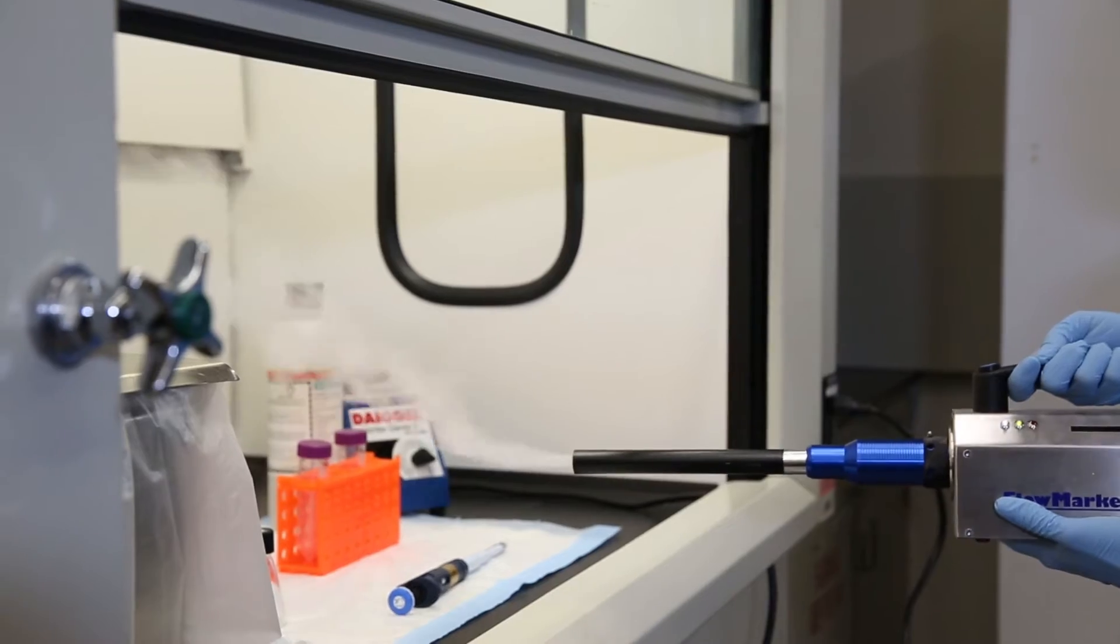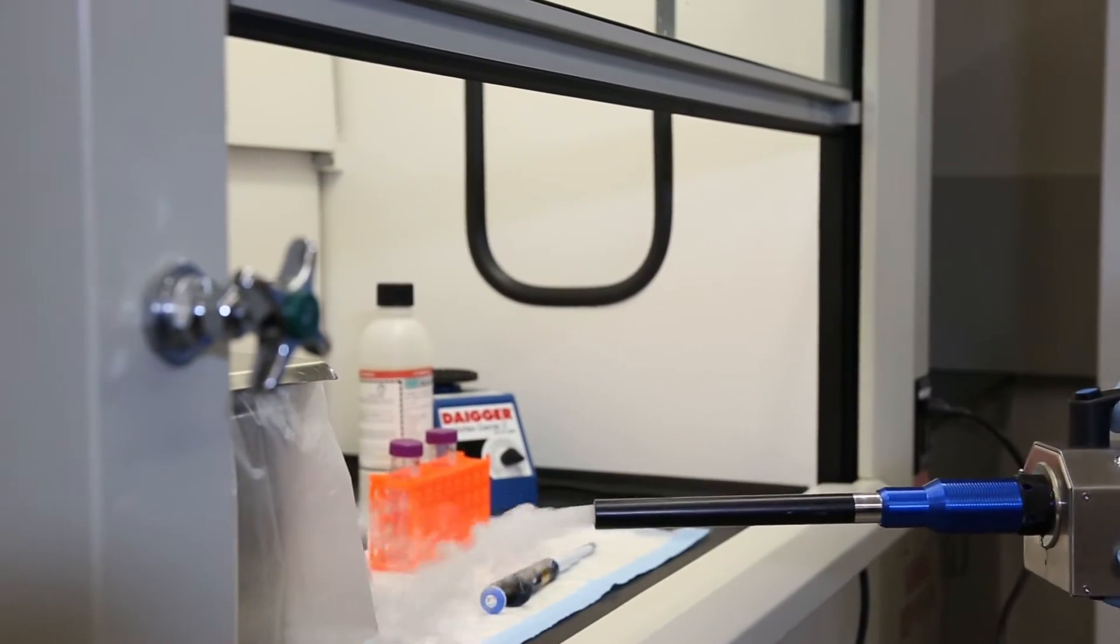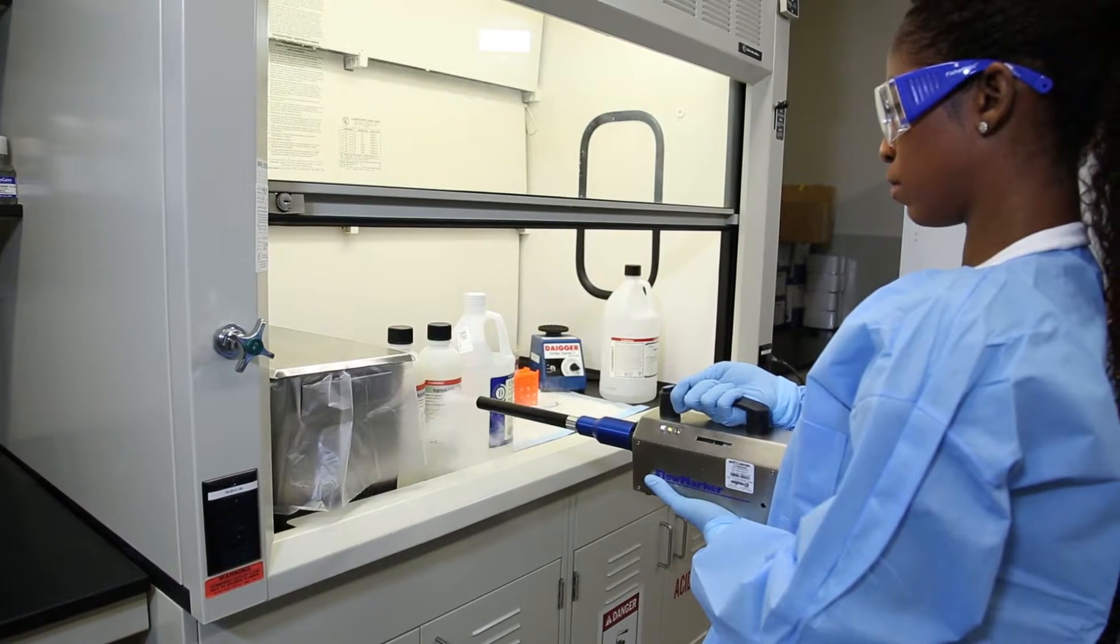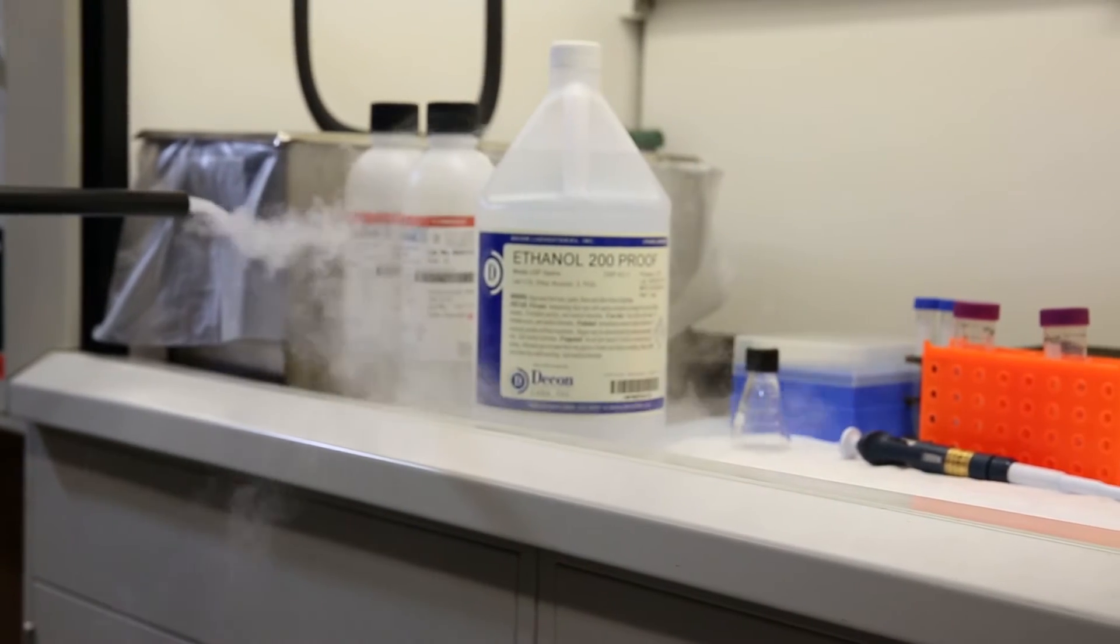Many conditions can affect the efficiency and safe operation of a fume hood. Chemicals closer to the front of the hood are more likely to leak from the hood.